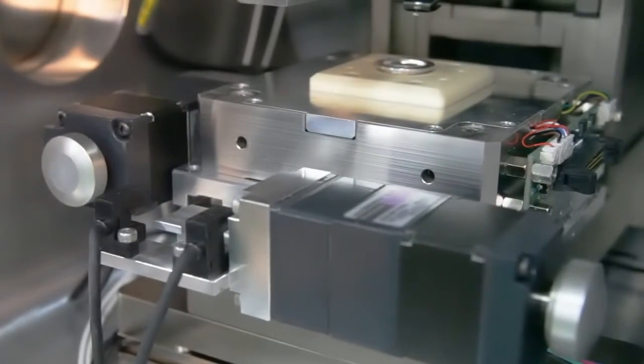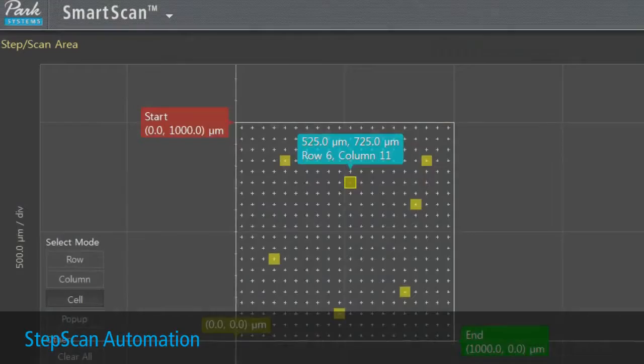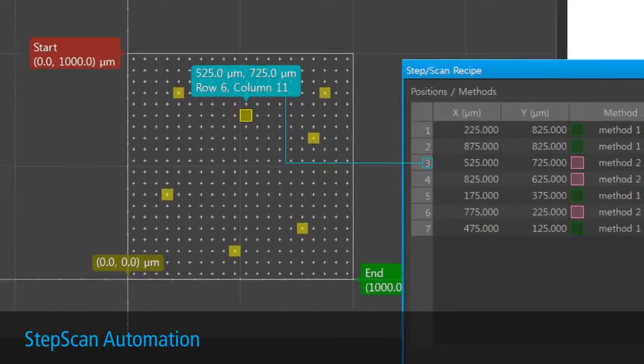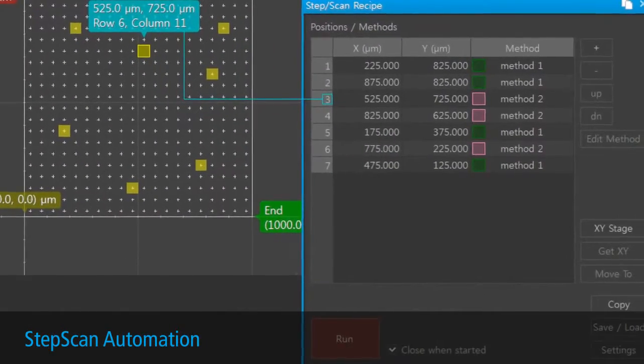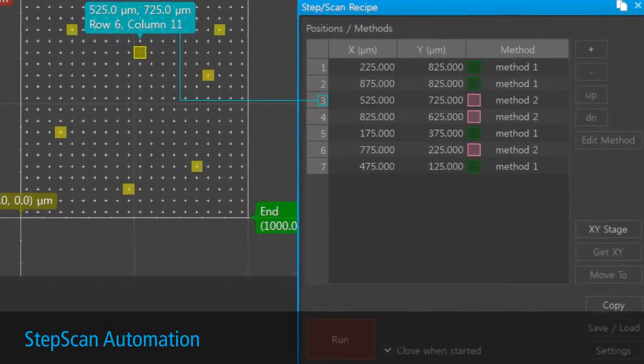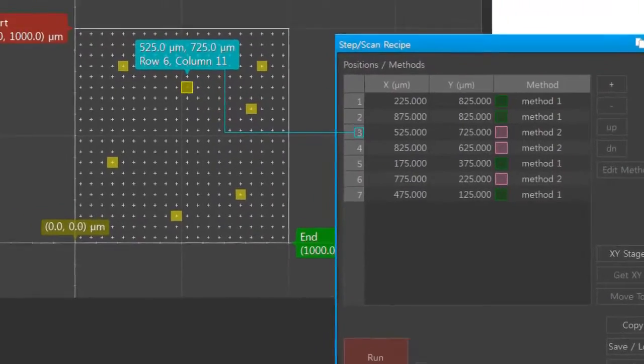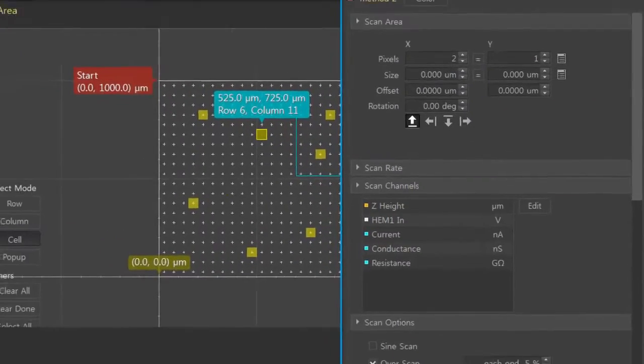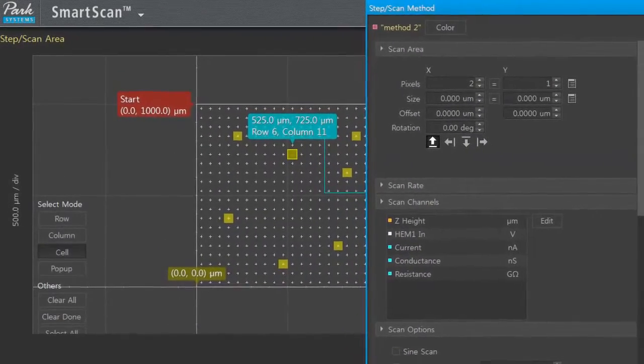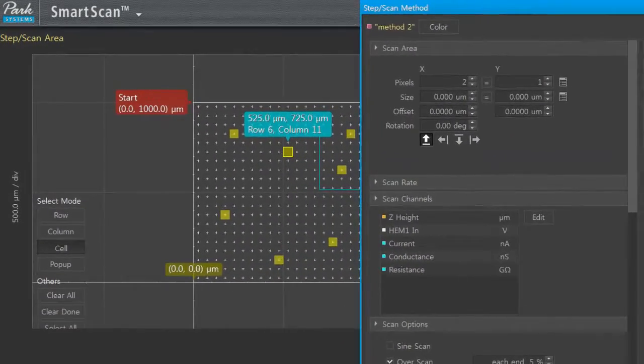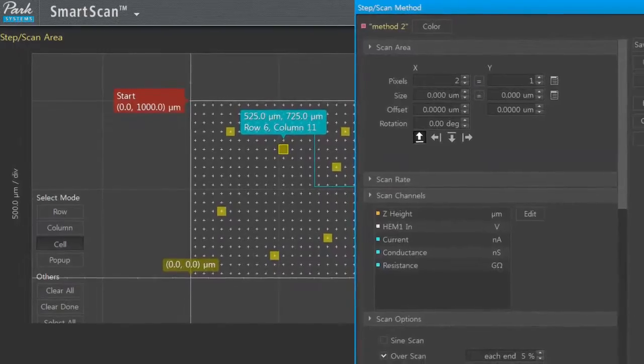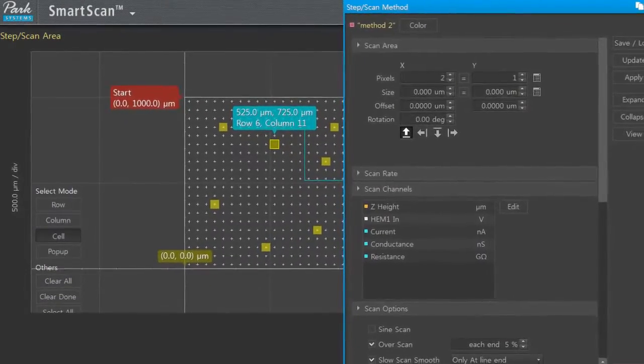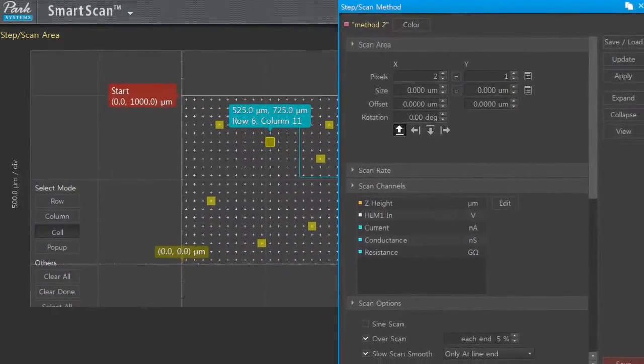Together, the motorized stages and the software step scan function enable automatic imaging of multiple samples via user created recipes. This powerful ability allows multiple AFM images of a sample to be acquired and data to be collected, all without user supervision.